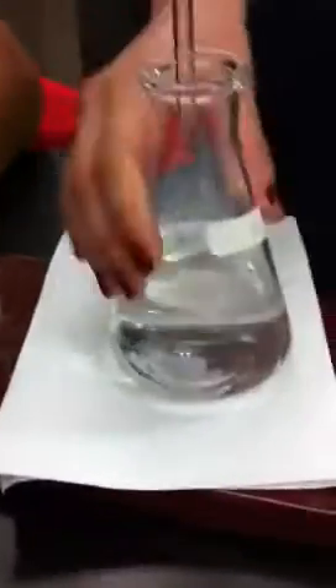Wait, it's clearing up again though. No, that's pink. It's clearing up. It's definitely pale pink. Should we put one more drop? Yeah, because you can't see the pink in the video — I'll walk it.